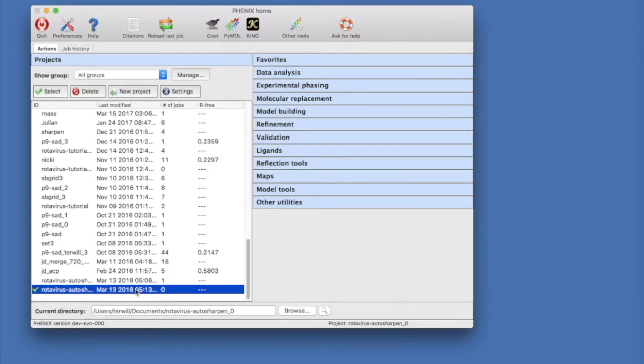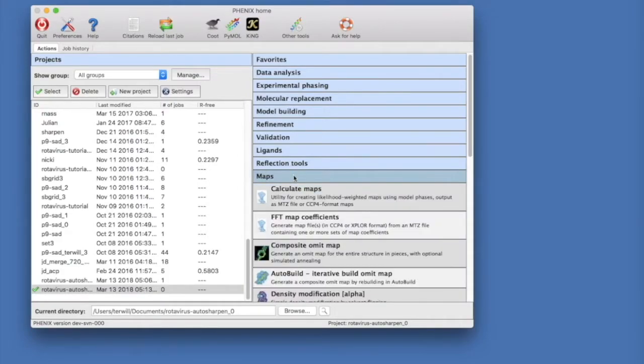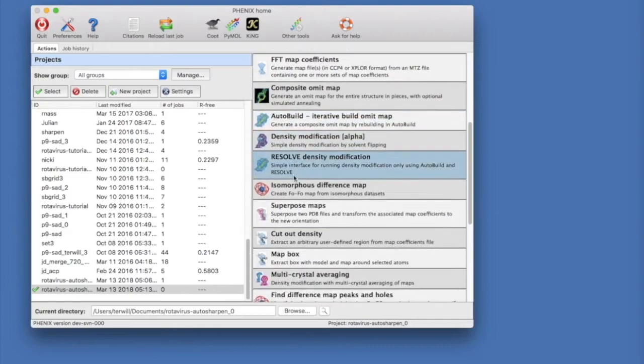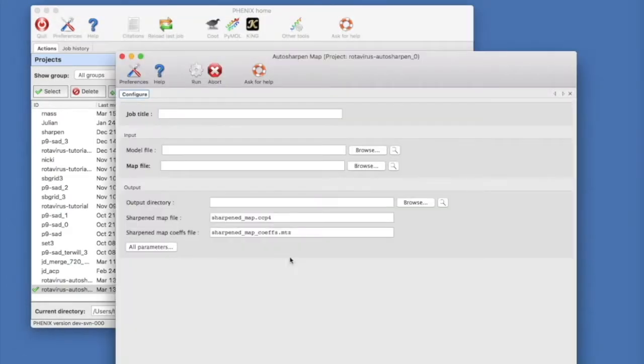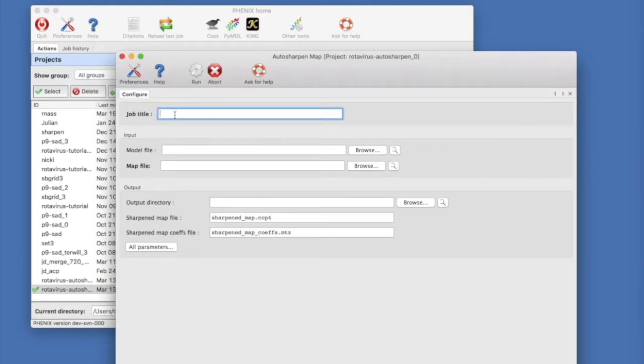To run auto sharpen, click on Maps and then scroll down and click on Auto sharpen map. This will set up a new auto sharpen run. Let's put in a title.